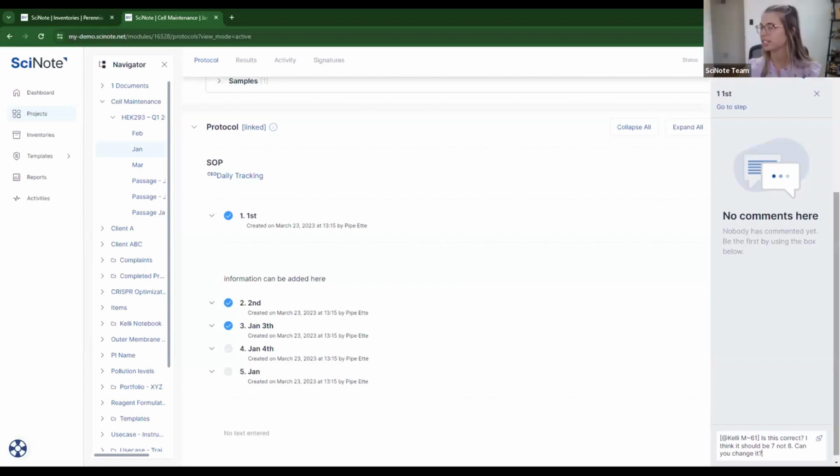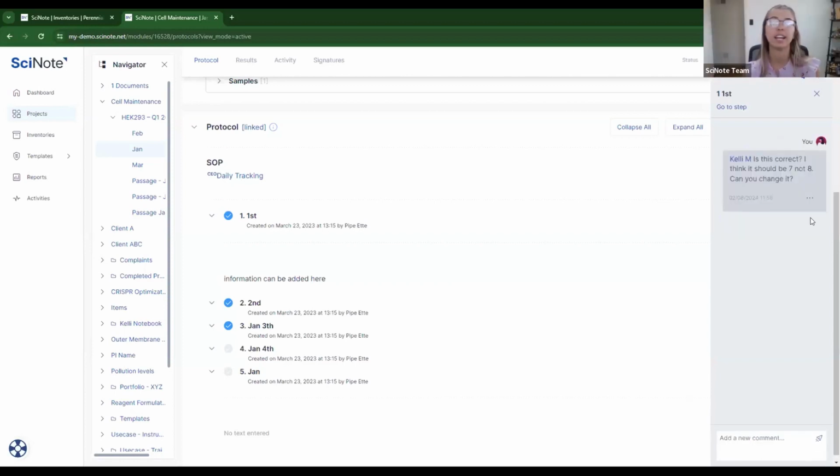Yeah, so what I did here was just because I'm a technician and I can't make edits, I tagged the person who maybe is above me, the user that can make edits, and I asked them, and they'll get a notification or an email if they have it set up, and then they could go in, check it out, make those edits if needed. Yeah, like if you have a QA team in-house, or if SOPs have been put through the ringer and you've come up with a final version of it and you want everyone to follow that same version, you can limit people from modifying it, which I think is great again for traceability and reusability of protocols.